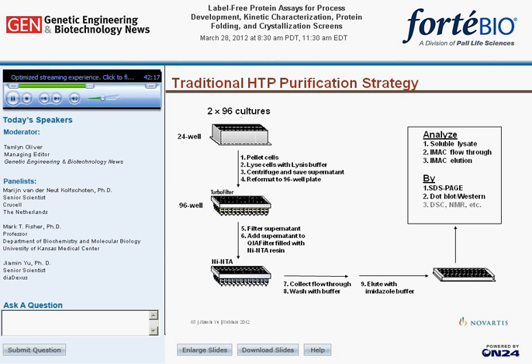In the literature, there have been papers describing the use of biophysical methods such as DSC, NMR, etc., to screen the IMAC product. However, such methods usually require proteins to be relatively pure and that there is a large amount of it. These methods are also quite time-consuming.